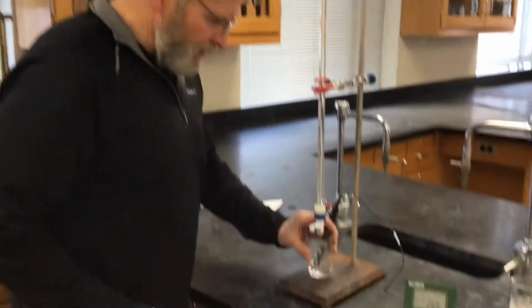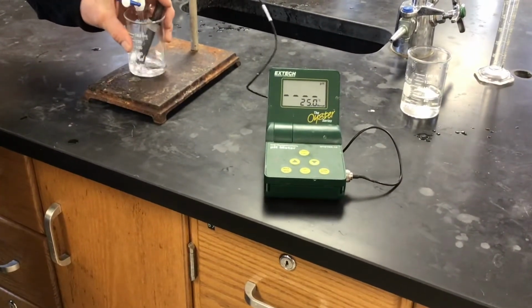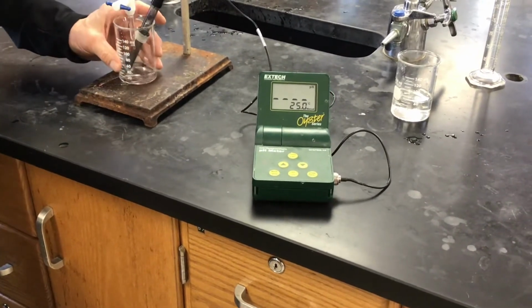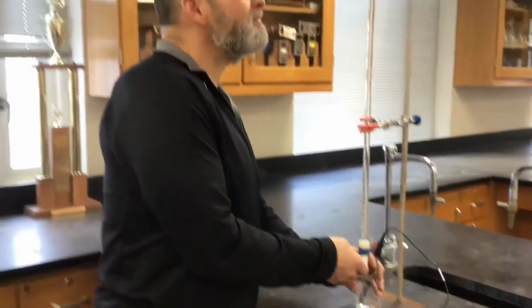There's 2 added. I hope the meter hasn't given up the ghost. Okay, there's 2 ml. 0.00.